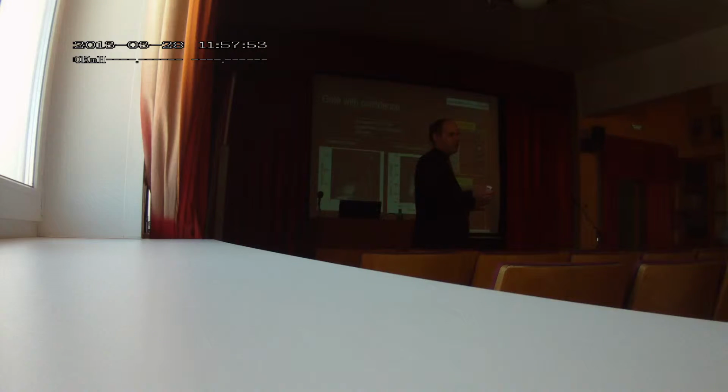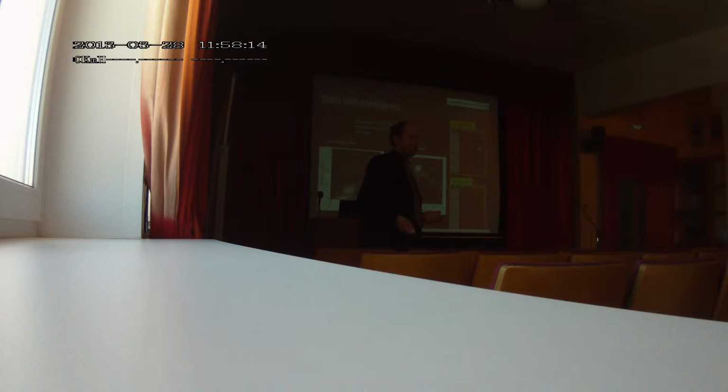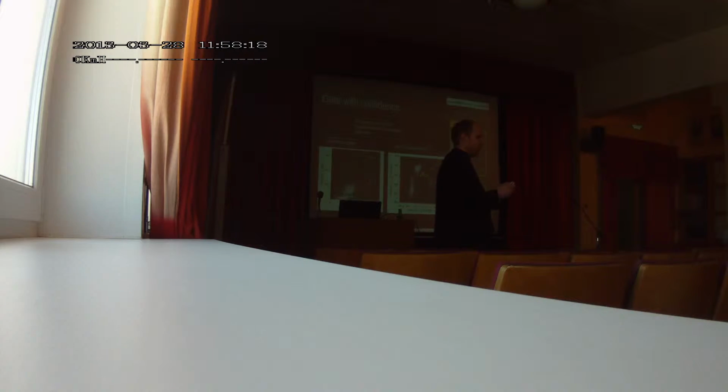There are immunologists who are looking, for example, at the immune interactions between the T cells and the B cells. And here you can gate specifically on the doublets and observe the biological changes, for example, in the T cell. One of the applications would be the migration of the adhesion compound of the T cell from the cytoplasm to the place of the immune synapse.